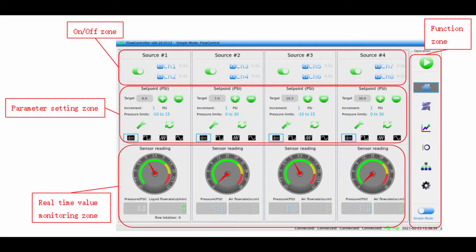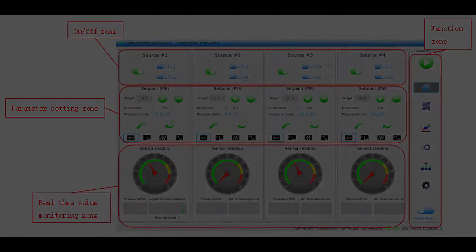Welcome to the simple mode. The UI here shows four independent pressure sources which can control pressures from negative 7 psi to 13 psi. There are four distinct zones on this screen: Zone 1 along the top is the on-off zone, Zone 2 along the middle is the parameter set zone, Zone 3 along the bottom is the real-time monitoring zone, and Zone 4 along the right side is the function zone.